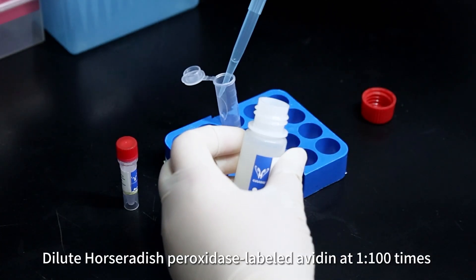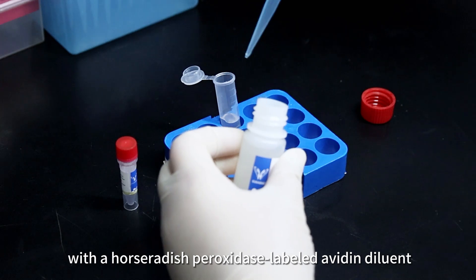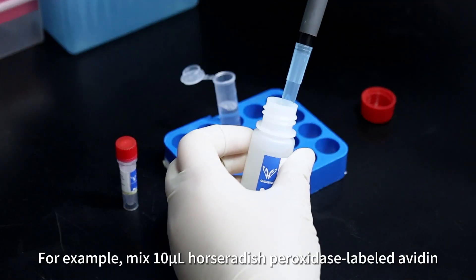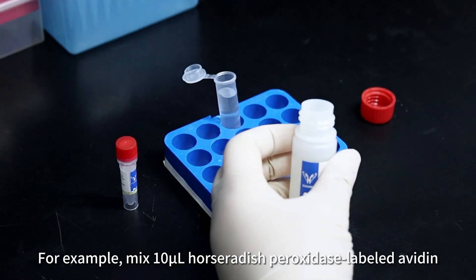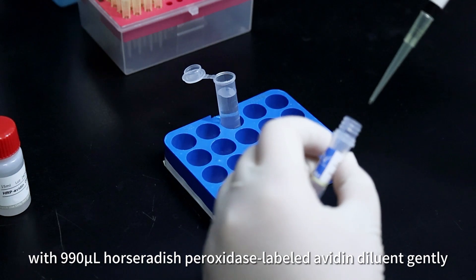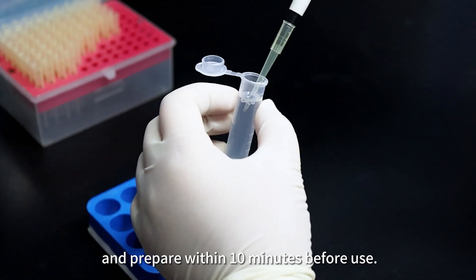Dilute horseradish peroxidase labeled avidin 1:100 with horseradish peroxidase labeled avidin diluent. For example, mix 10 µL of horseradish peroxidase labeled avidin with 990 µL of horseradish peroxidase labeled avidin diluent gently, and prepare within 10 minutes before use.